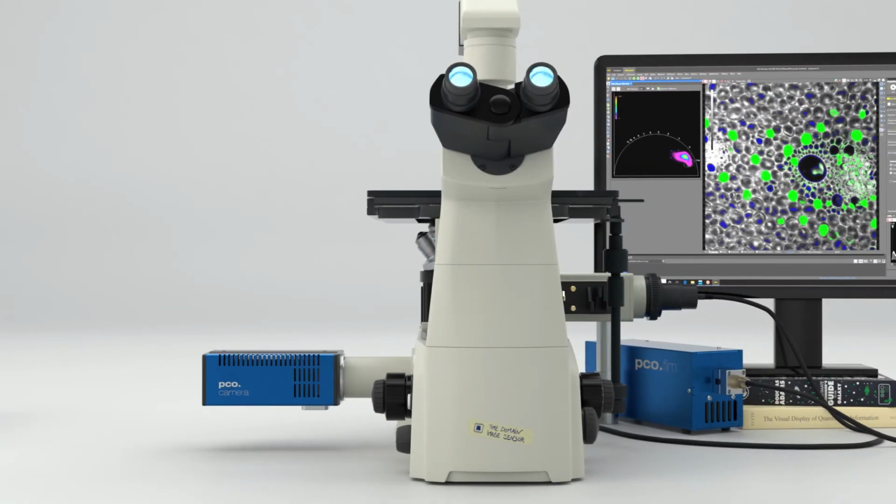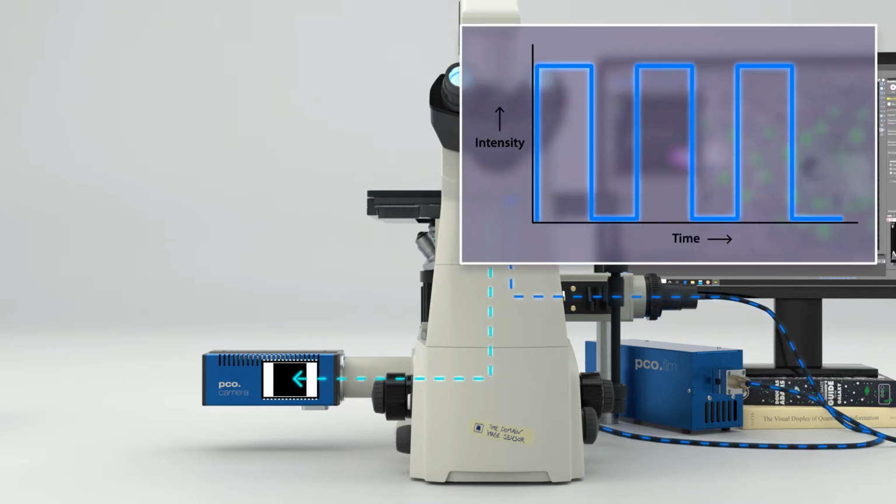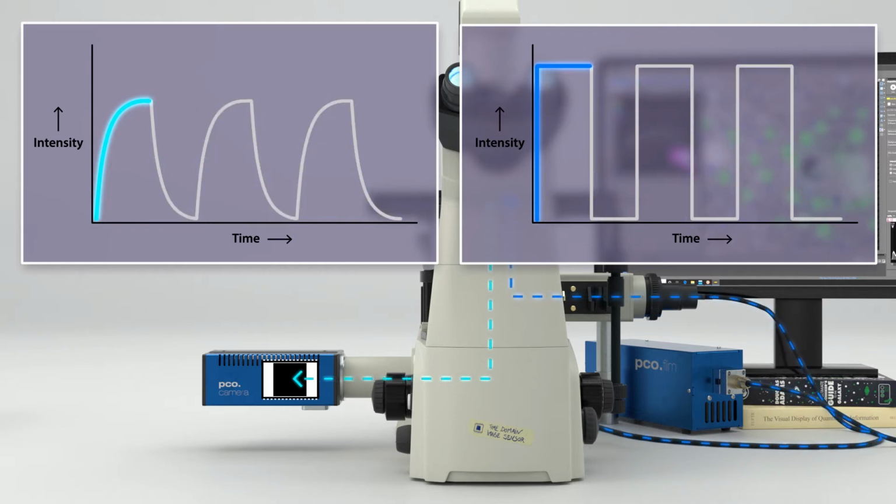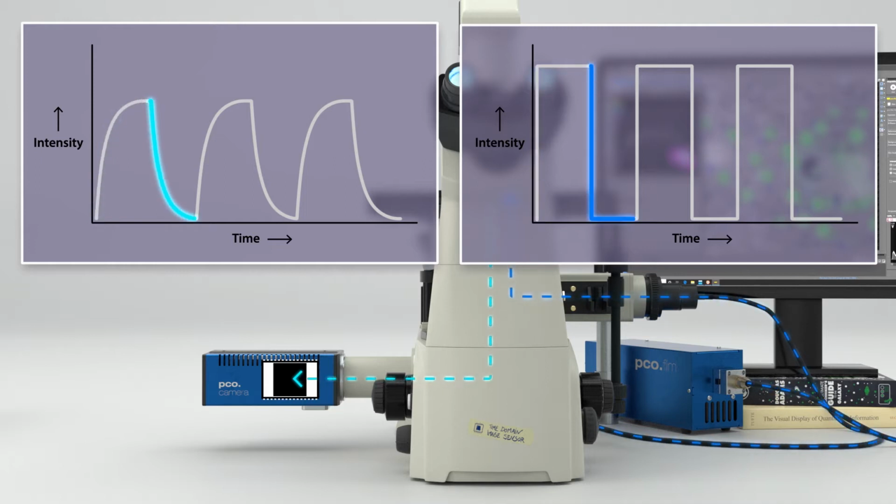Another kind of time domain FLIM uses a digital image sensor. In this setup, the sample is excited by a periodic train of rectangular light pulses. Each excitation pulse results in a slightly delayed, weaker emission signal, starting with a sloped rise of the emission intensity giving the rise time, and a decaying emission after the excitation light has been turned off giving the fall time.